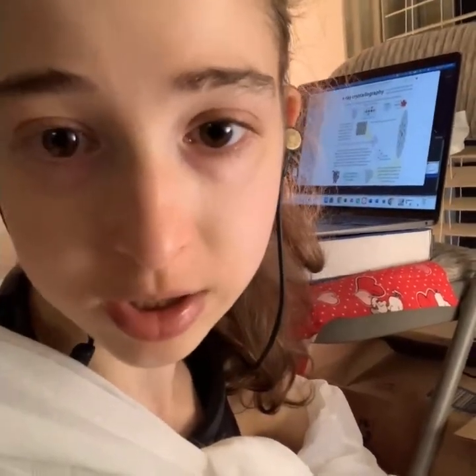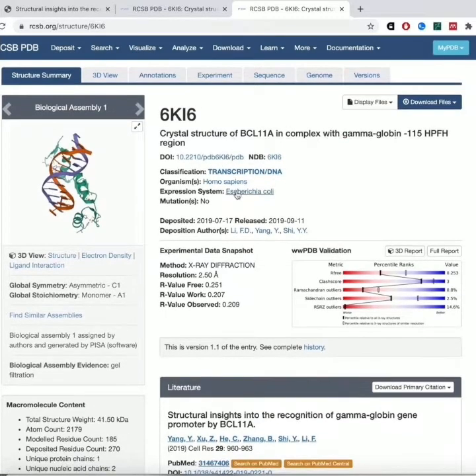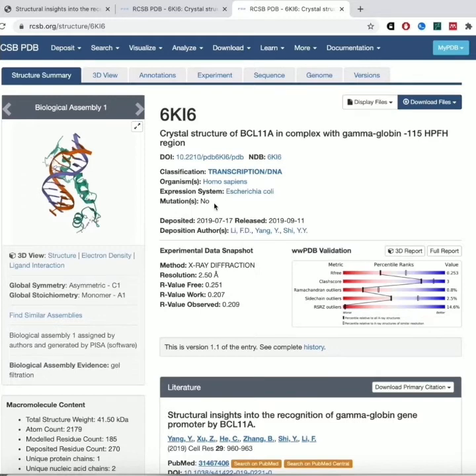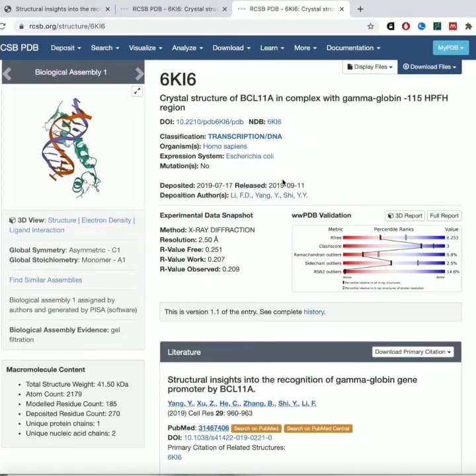If we look at the basic information, it'll tell us the type of protein it is and the organism — so this is a Homo sapien, so it's a human protein. It was expressed in E. coli, so basically they used bacteria to make the protein for them. Mutations: no — this means they didn't introduce any mutations into the protein in order to get it to crystallize, other than like truncating the region.